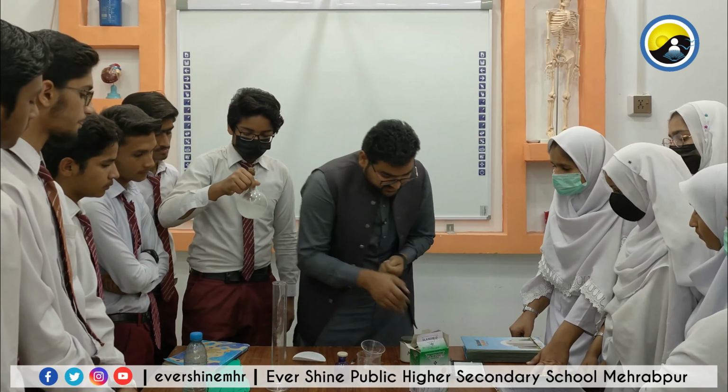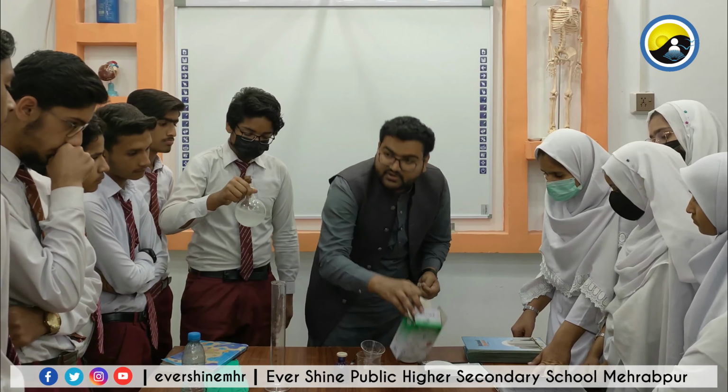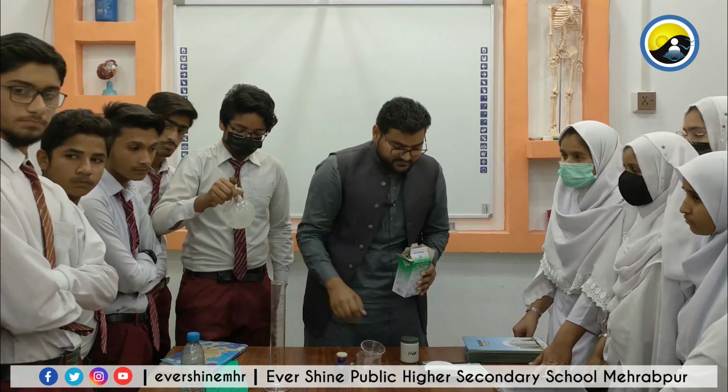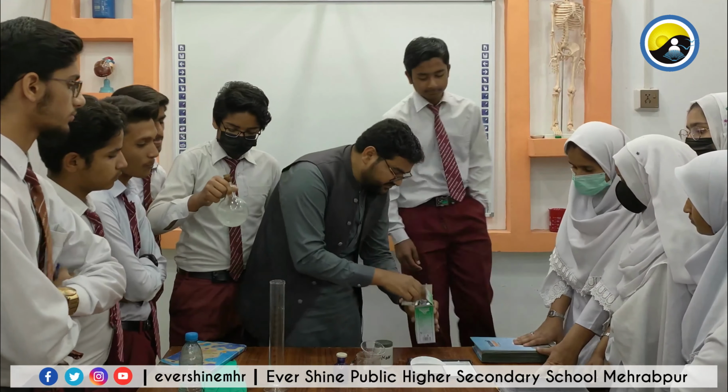Now we need to measure 10 grams of glucose. So come here and measure exactly 10 grams of glucose.